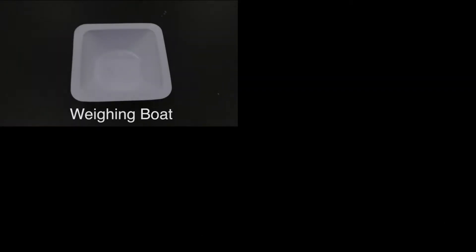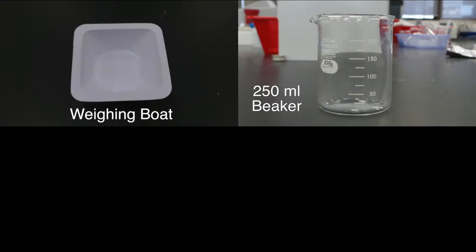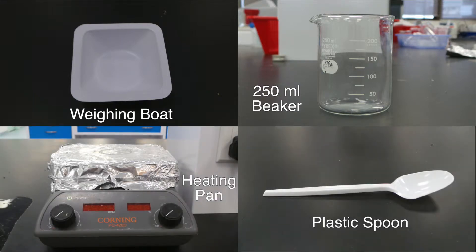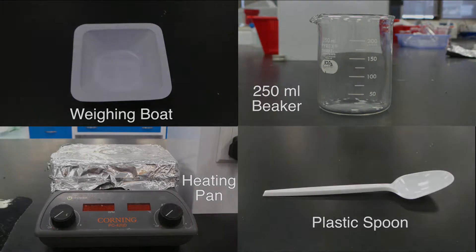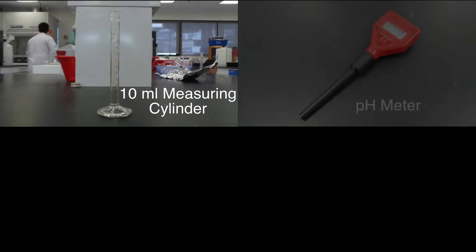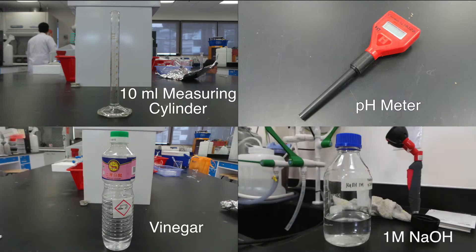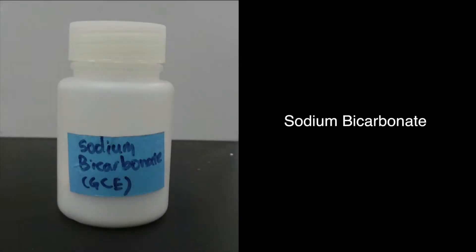In this experiment, the apparatus and reagents needed are: weighing boats, 250 ml beaker, heating pan, plastic spoon, 10 ml measuring cylinder, pH meter, vinegar, 1 mol/L of NaOH, and sodium bicarbonate.